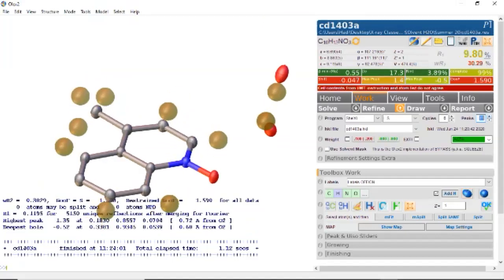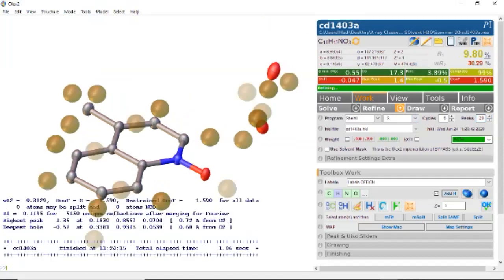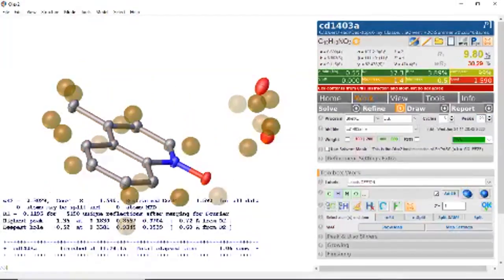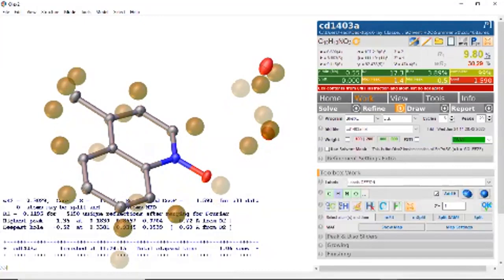If we increase the number of peaks, say to 20, and we refine, you'll see that all the remaining Q peaks correlate to hydrogen atoms. And you'll notice on this carbon atom here, there are 3 Q peaks, signifying that there are 3 hydrogens located off this carbon. Whereas you look at this oxygen here, there's no Q peaks. So it signifies there's no hydrogens off of this oxygen atom. And so that kind of confirms that this is an oxygen, and this is going to be a methyl.